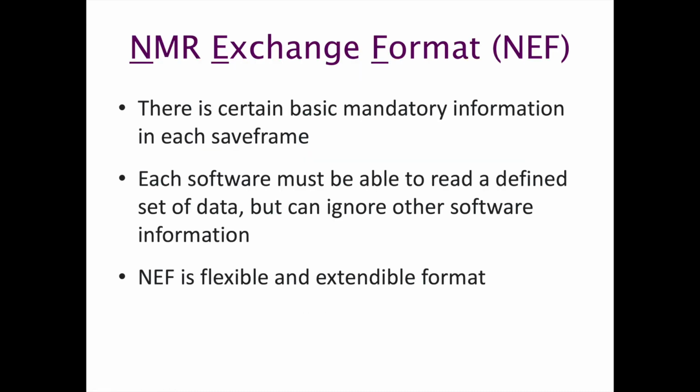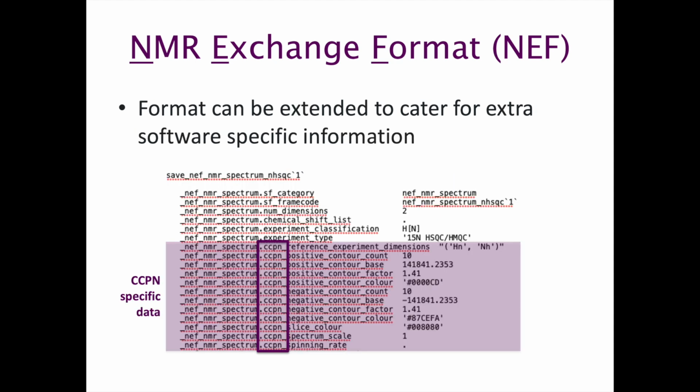So within the NMR exchange format, it's been agreed on a certain amount of basic information which is mandatory in each save frame. Each software must be able to read that defined set of data, but any other data provided by other software packages can be ignored. So NEF is very flexible in that way and also extendable. And an example of that is here.